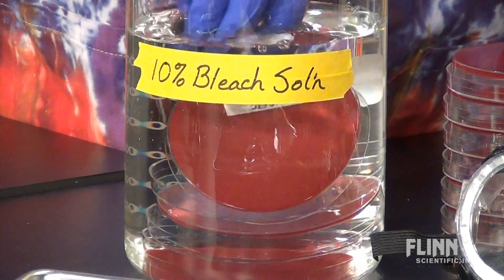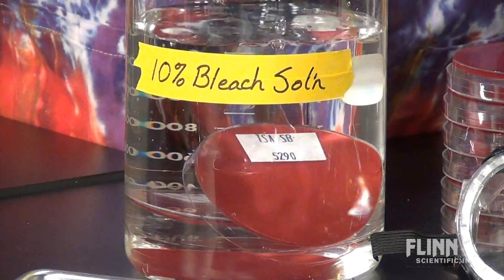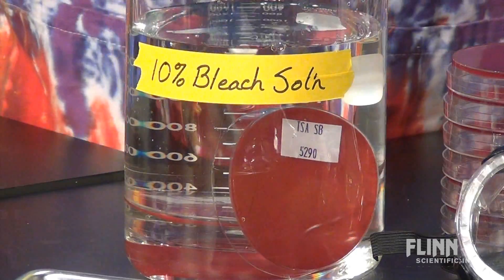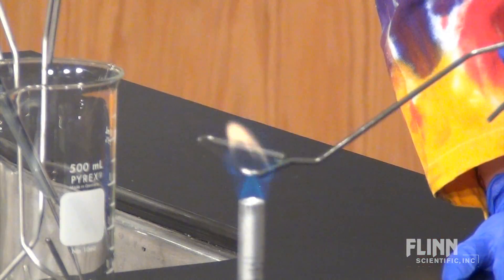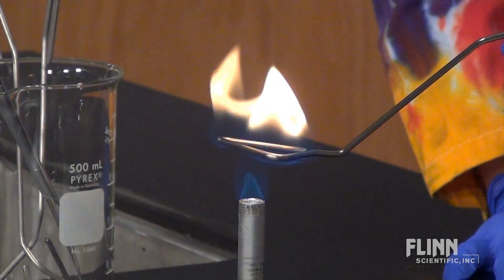Culture plates should be placed in a 10% bleach solution, opened under water, and allowed to soak overnight. It is also a good idea to dip inoculating loops and bacteria spreaders in an isopropyl alcohol solution and pass them through a flame.